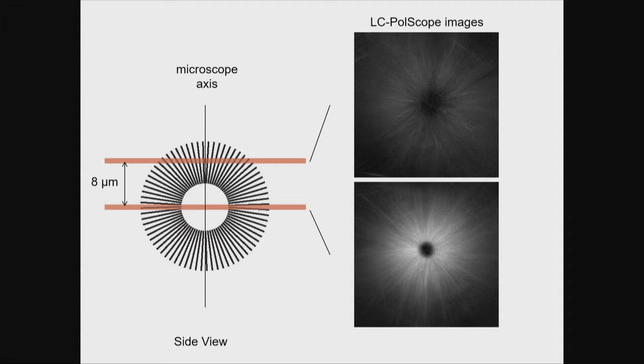Intuitively, if you think of a microtubule as a round cylinder, and you look at it end on, there's no anisotropy. Whereas if you look perpendicular to the cylinder axis, there is more polarizability along the cylinder axis versus perpendicular to it, and you have a high anisotropy. But if you look down, it's not anisotropic. So that's why in a single viewing direction you don't get a signal from the anisotropy that is parallel to the viewing direction.